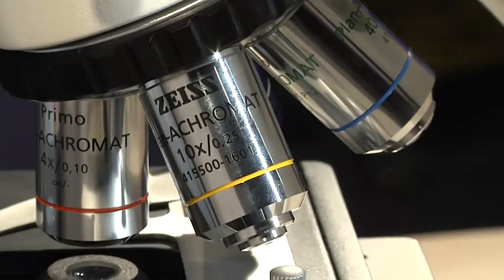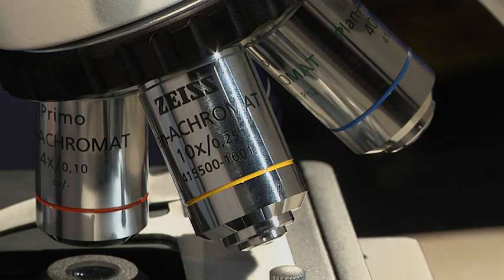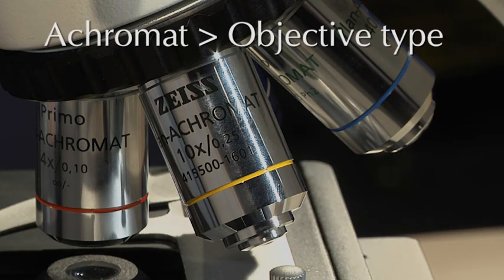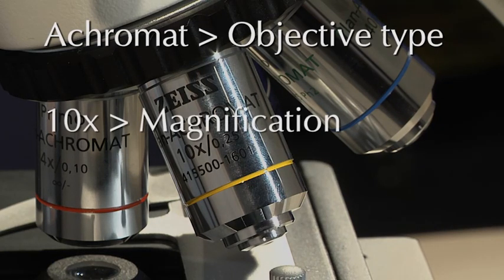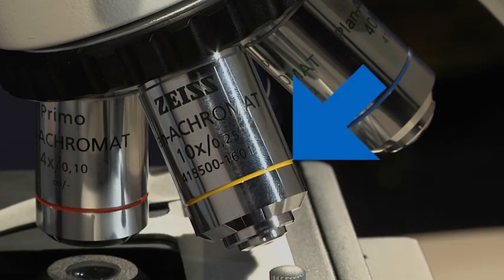It is important to have a look at the objective specifications. You find the objective type, the magnification, the numerical aperture, and the magnification color code on the objective body.